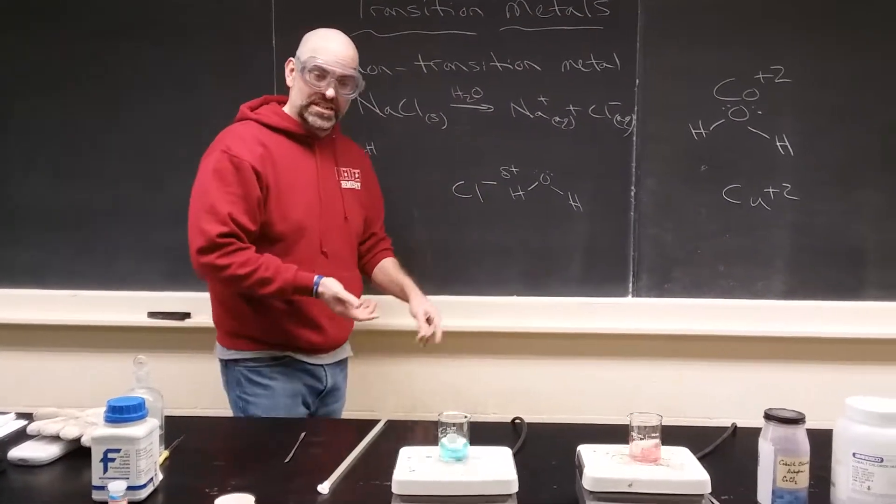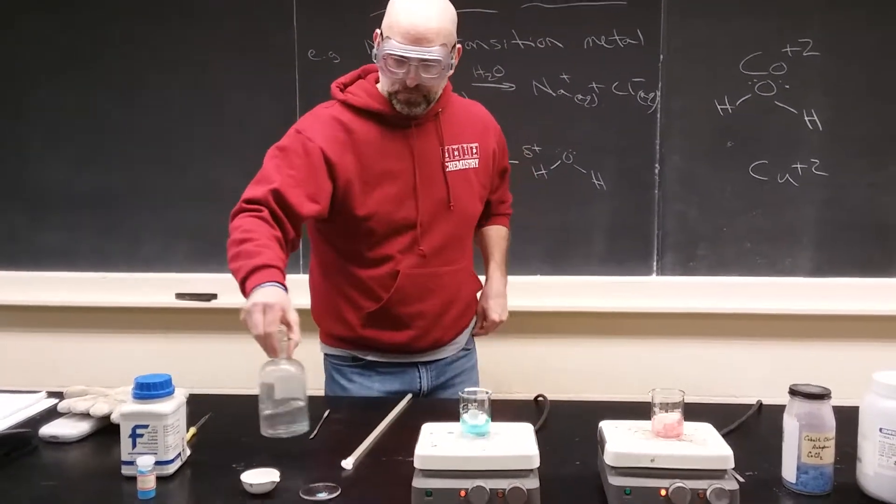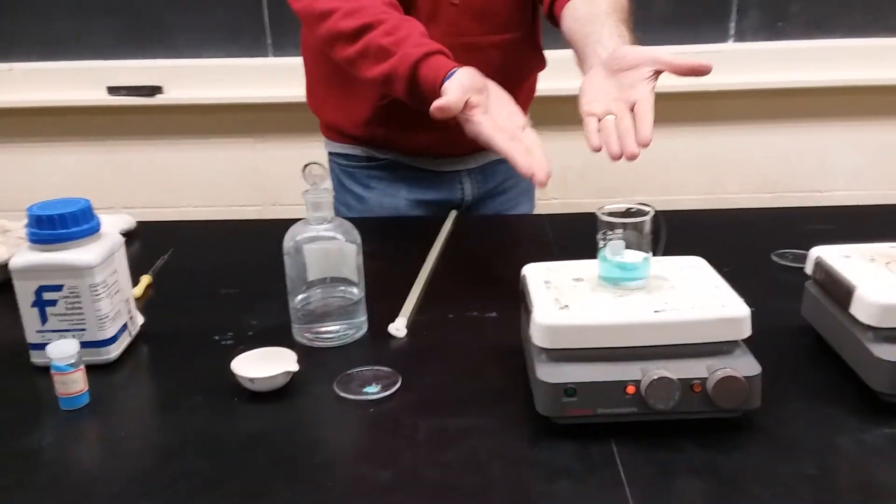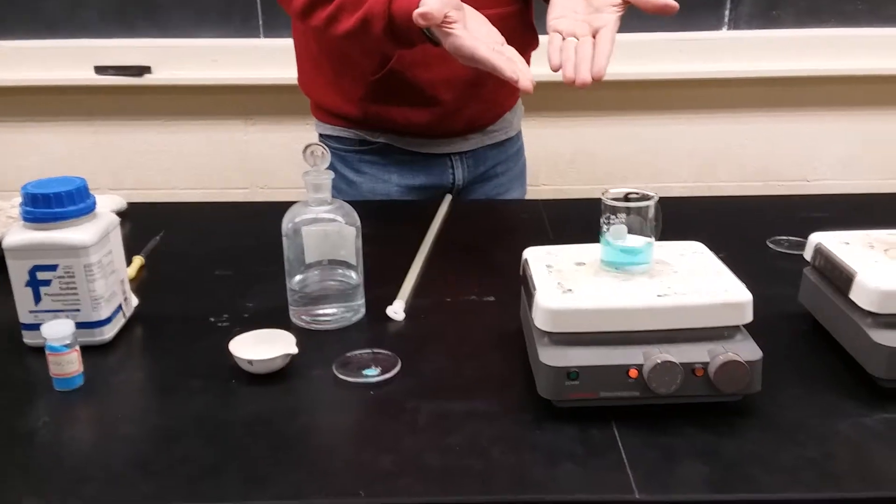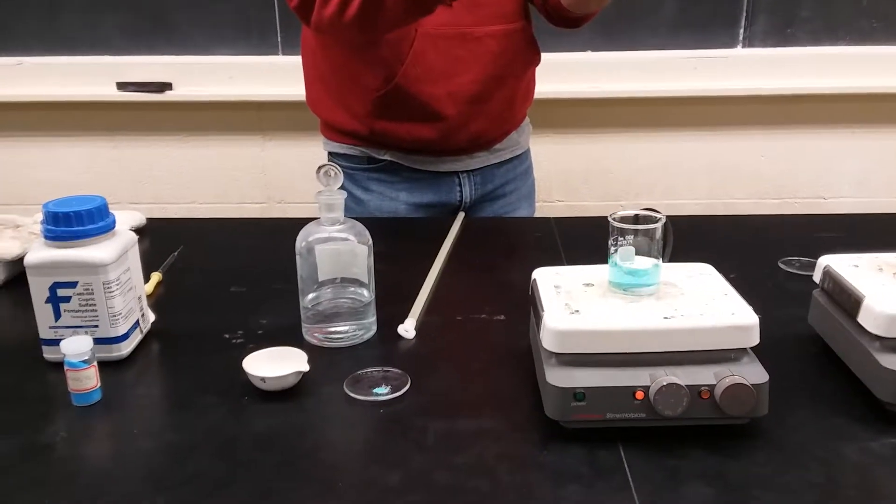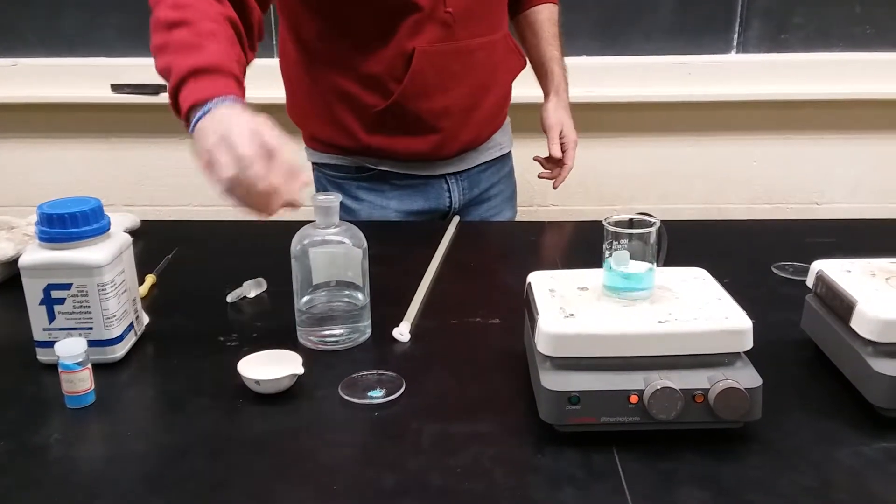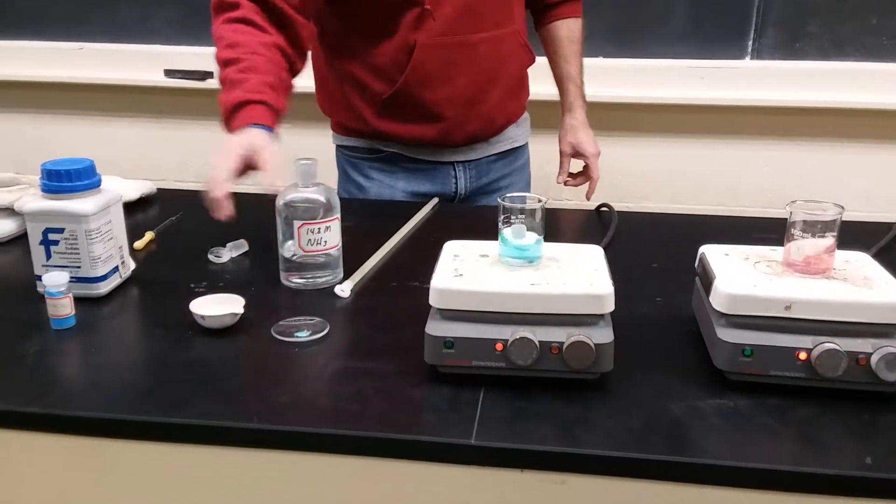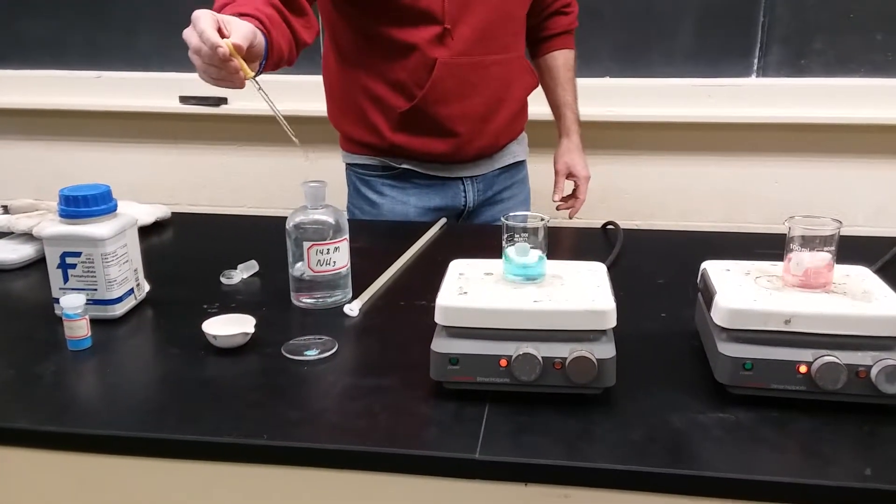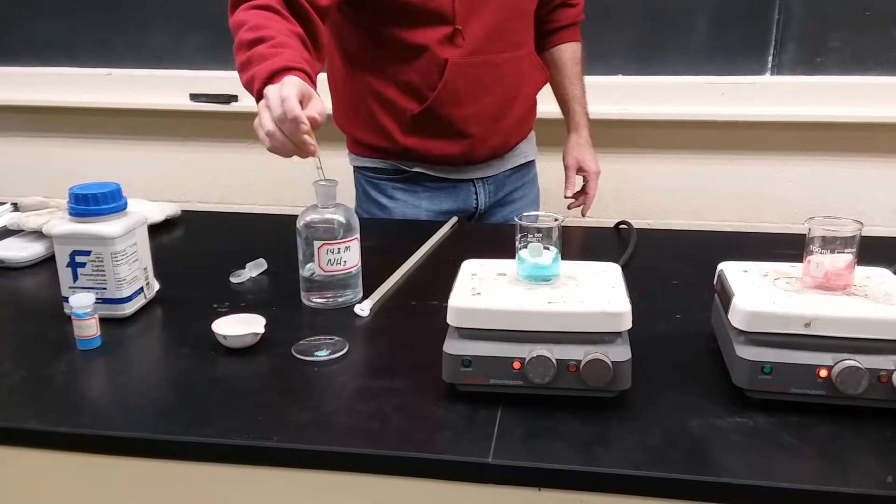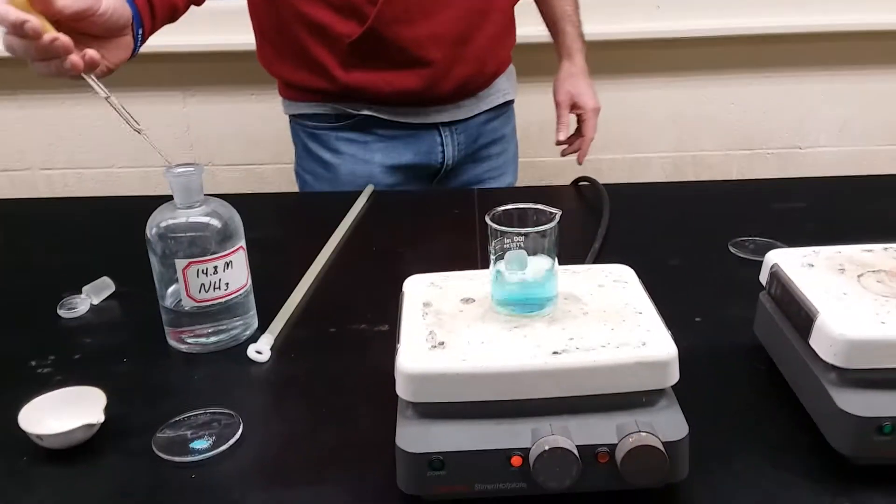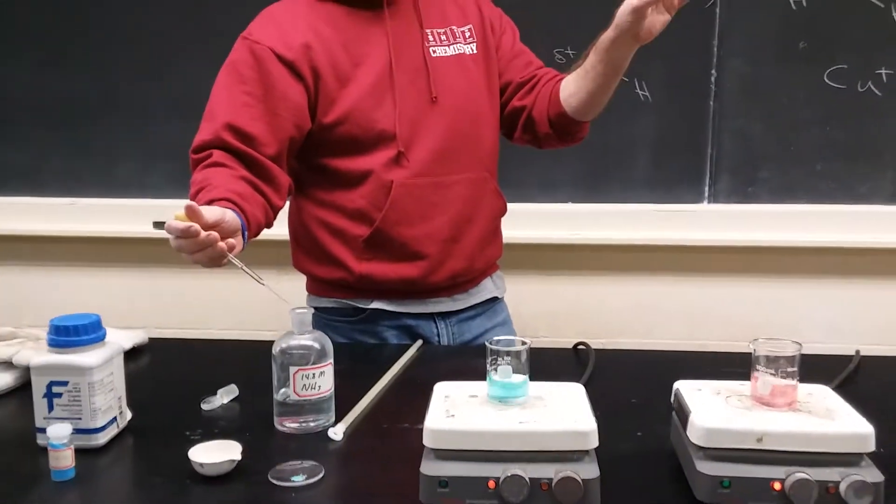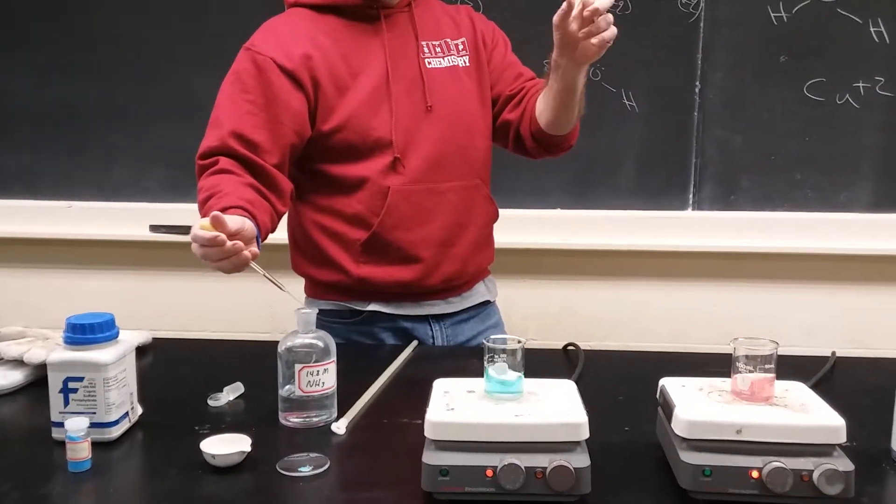The other thing I want to show you in this demo is what happens if we put something other than water in there. Is water the only thing that will essentially grab onto the transition metal? Well, no. I'm going to show you something here. This is concentrated ammonia. So I'm going to take some concentrated ammonia and add it to this. And there's competition now. We have NH3, that's ammonia, and H2O, both of which will grab onto the transition metal. And they compete.